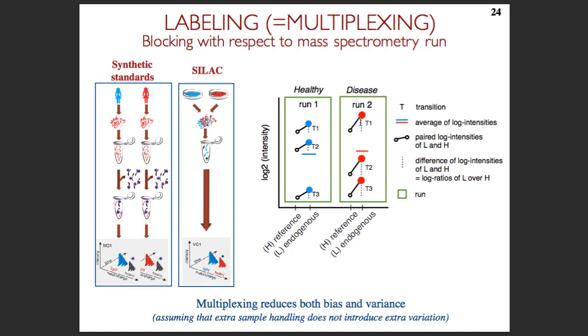And so now we can compare, instead of comparing the means of peaks, we can compare the deviations. And we see that on average, these deviations are larger. Therefore, this protein is upregulated in the disease group. And the way we actually do it, we specify the linear model, which would account for the sources of variation. And it's a generalized way of comparing these deviations to these deviations. This was one way to use blocking.